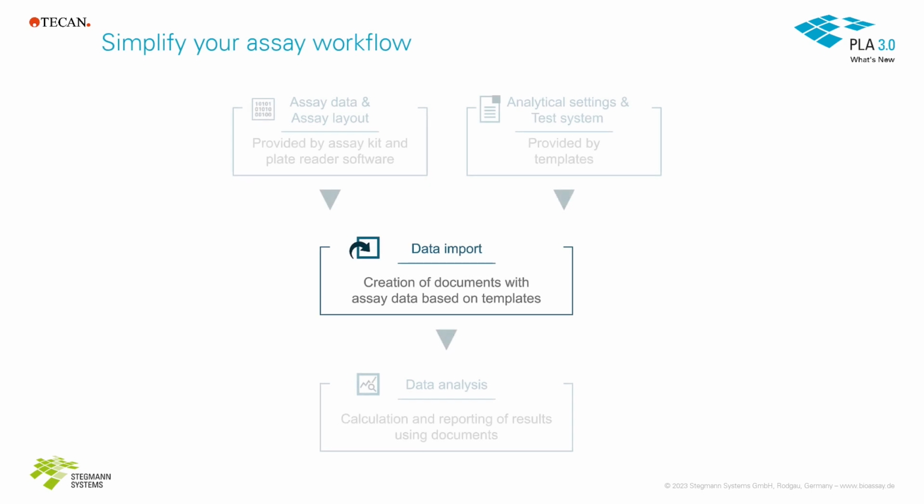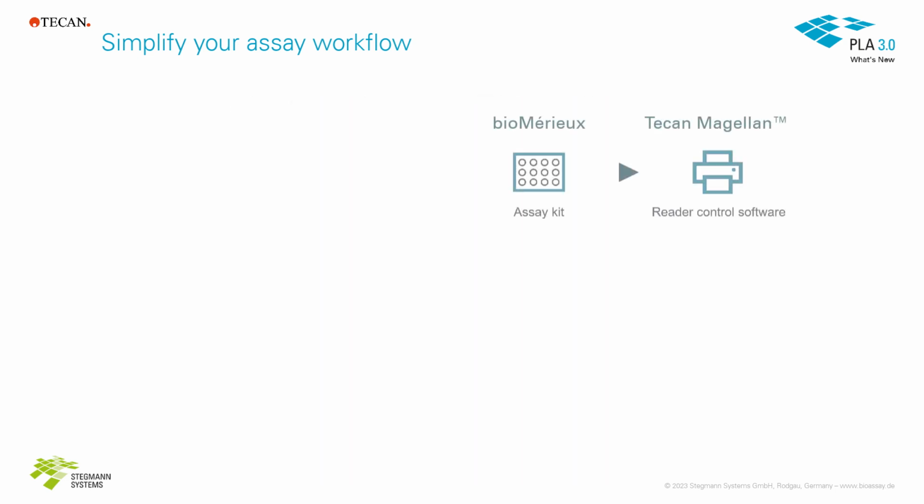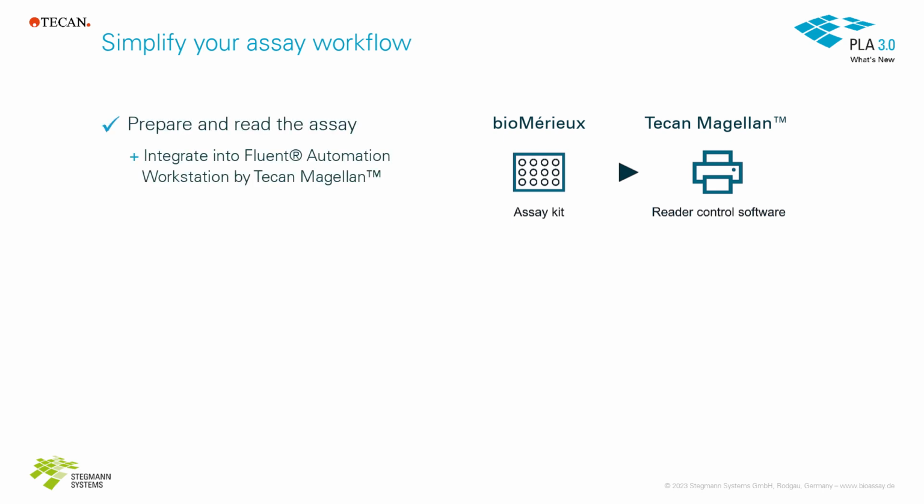The Tecan Magellan Import Module for bioMérieux Endotoxin Detection Assays is your tailor-made solution to ensure a compliant workflow. Proceed from plate reading to assay analysis and beyond in just a few steps. Use a bioMérieux assay kit and the Tecan Magellan Reader Control software to prepare and read your assay plates. You can also rely on the Fluent Automation Workstation by Tecan Magellan to streamline your workflow.